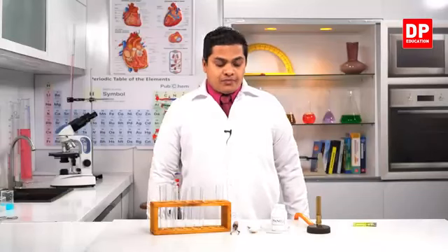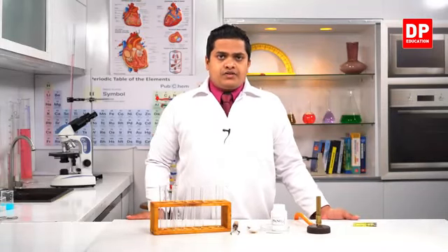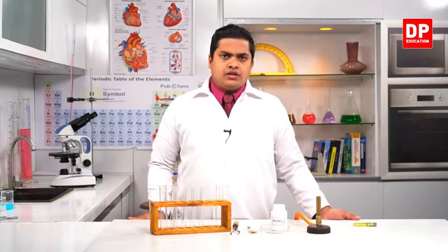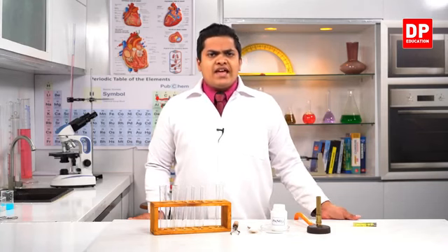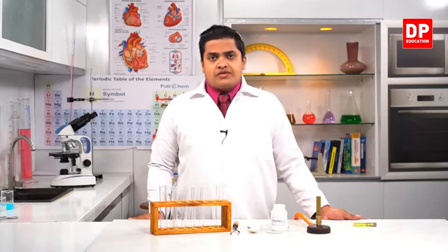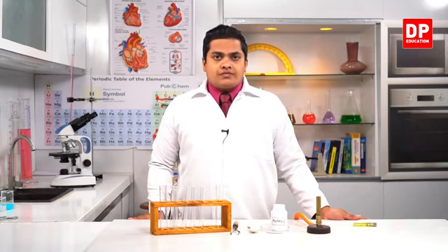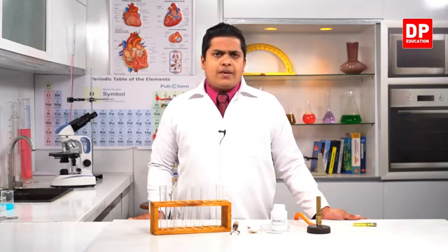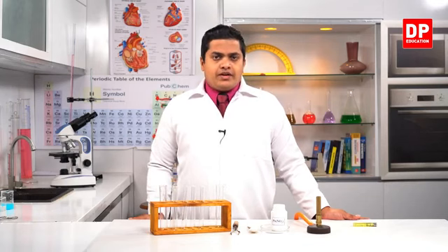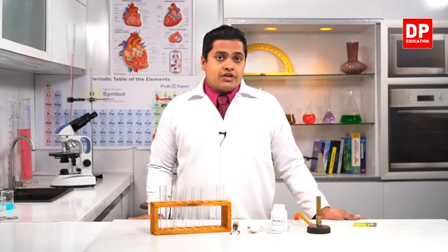Right, my dear children? Now, in this set of activities, we'll be observing what kind of evidence we can find during a chemical change, right? So when a chemical change occurs, what sort of thing will happen in the system and what will be emitted from the system, right? By using those things, how can we say whether a chemical change has happened or not.